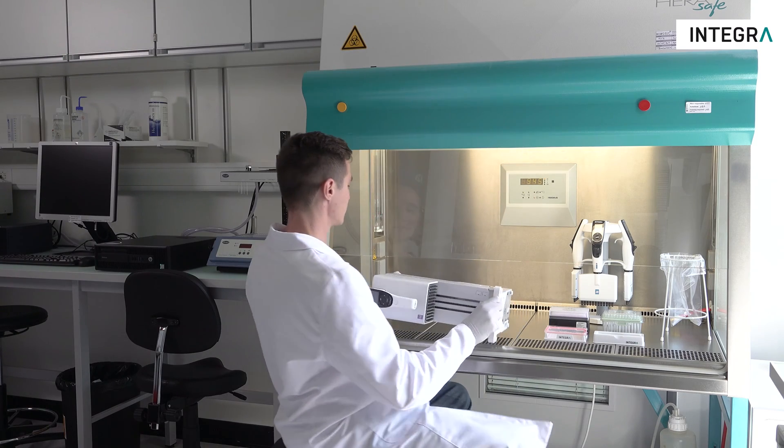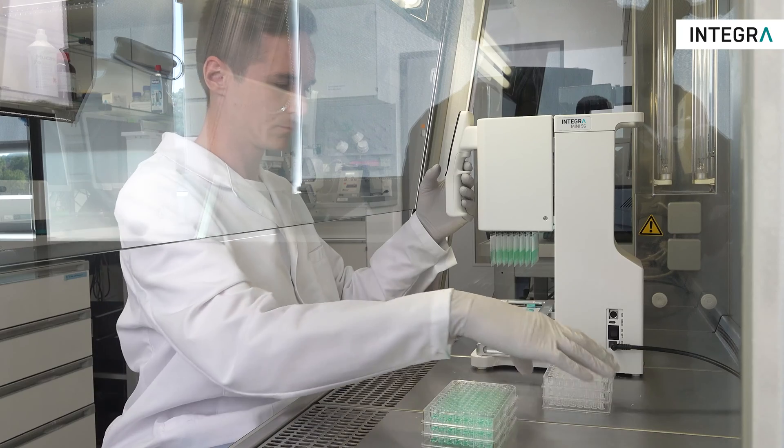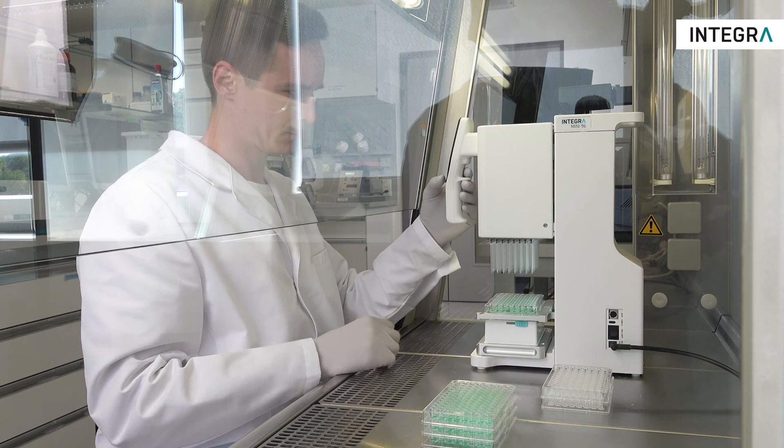Since bench space is a luxury in many labs, the small size really comes in handy. Its tiny footprint makes it especially suited for work in a laminar flow cabinet, where space can be restricted.